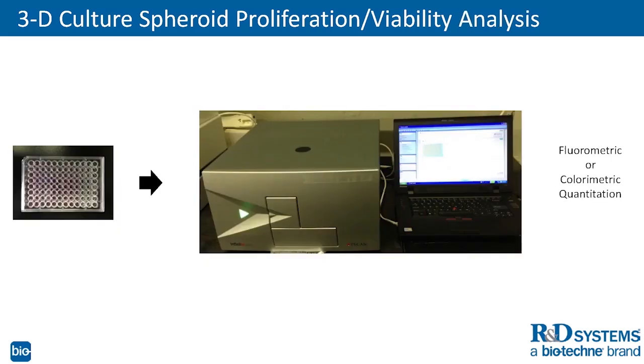So the growth measurements, they're very informative. However, they don't tell us really much about the actual cell proliferation or the cell viability. It can be misleading if you have a large aggregate of dead cells and you're measuring.